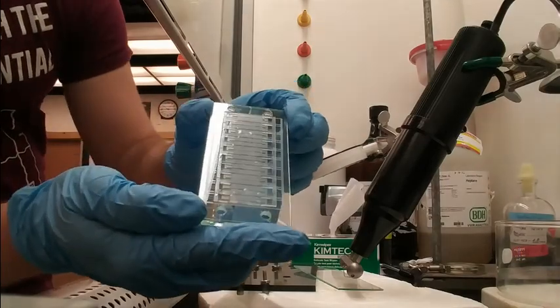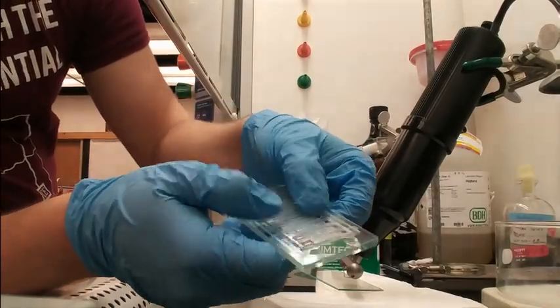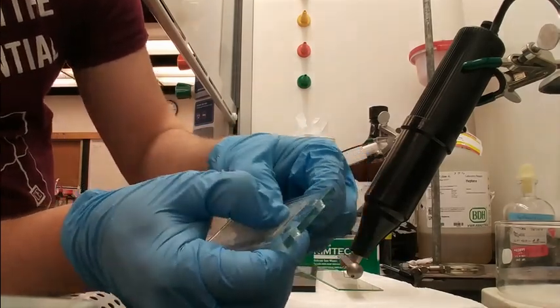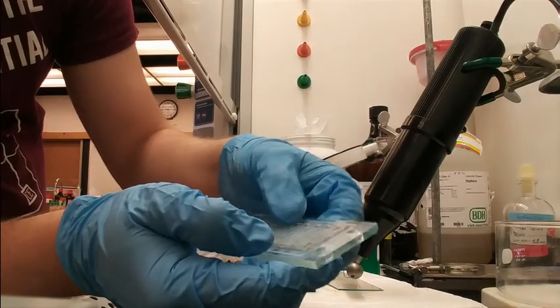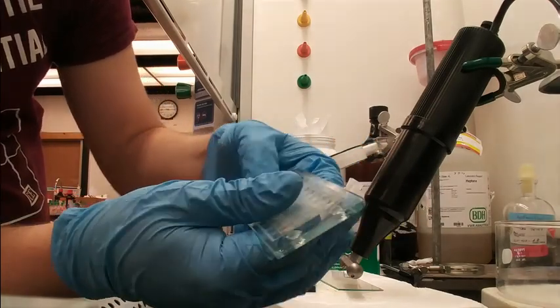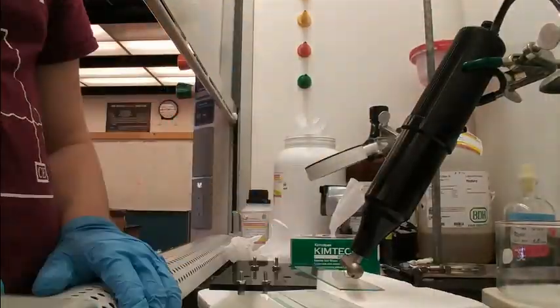After that, use your hands to push down on the PDMS to ensure that there are no air bubbles between the surfaces. Press the edges especially, as these are likely to not bond entirely. Finally, you can remove the plastic liner and allow it to bond overnight.